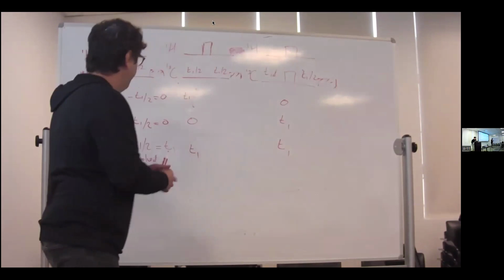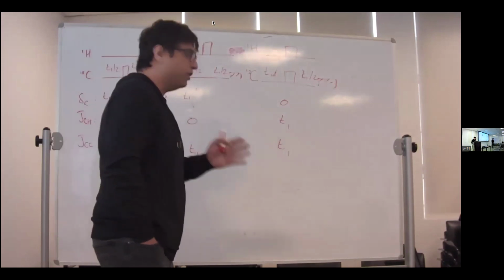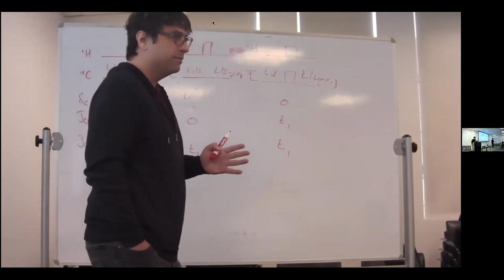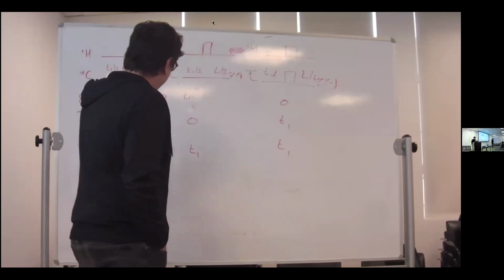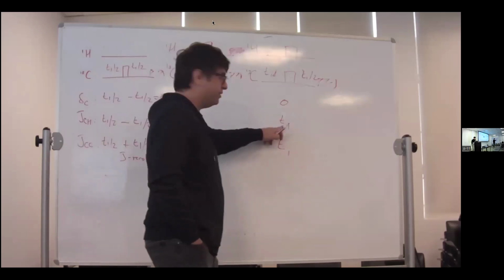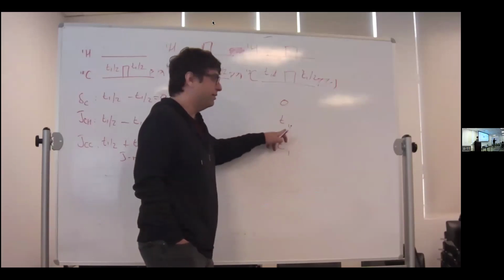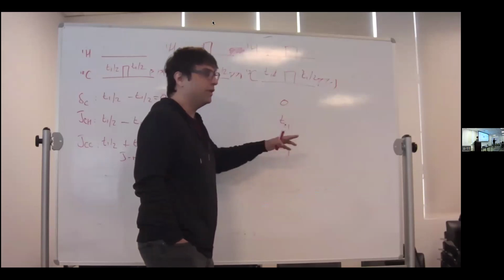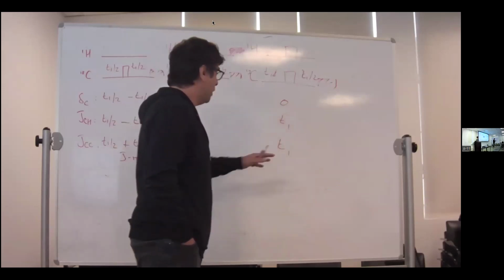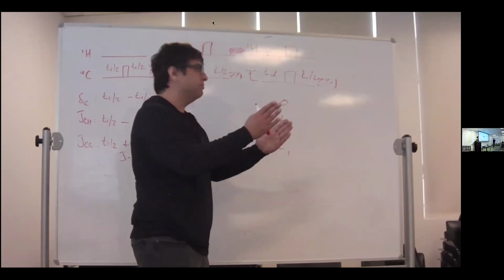So now, if you've noticed here in these experiments, let's say I want to measure just the CH splitting. None of these experiments accomplish it. Because when I have the CH splitting here, I also have the CC splitting. So how do I turn off the CC splitting, but only maintain the CH splitting? There are two ways of doing it. I mean, there are many different ways, but two obvious ways. Because I don't want to have a CC doublet. I want to have a nice clean CH resolved spectrum.